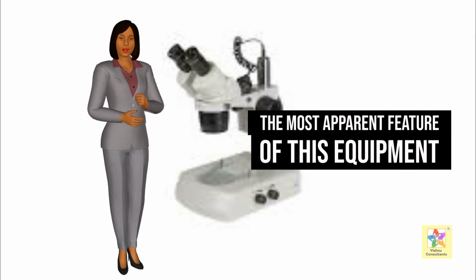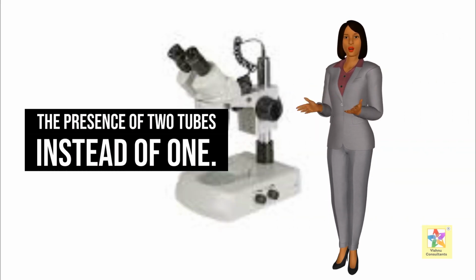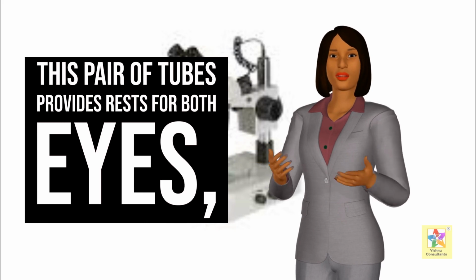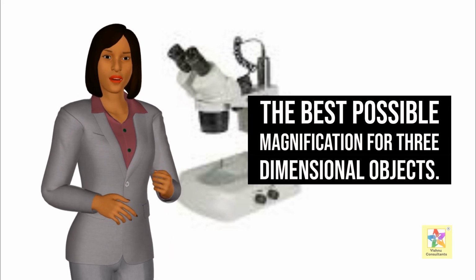The most apparent feature of this equipment, which has been fondly labeled as binoculars microscope, is the presence of two tubes instead of one. This pair of tubes provides rests for both eyes, and the images they provide are said to be the best possible magnification for three-dimensional objects.